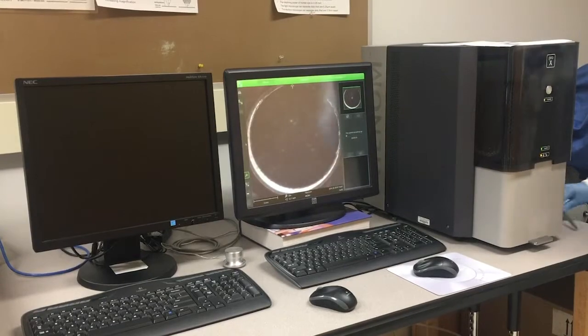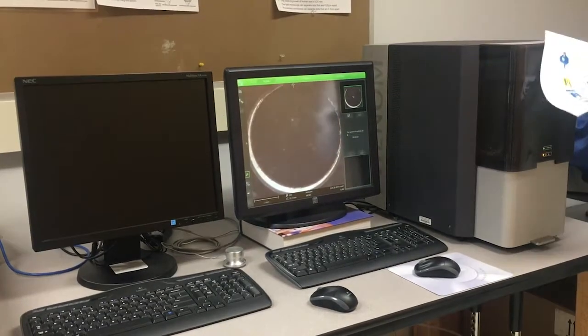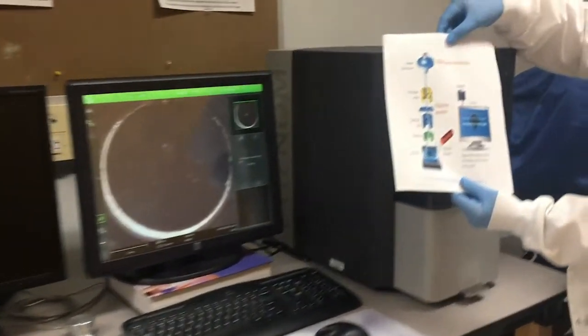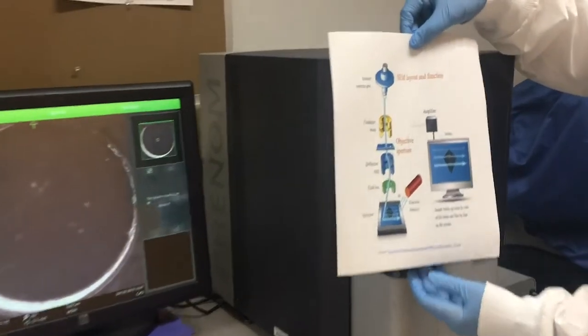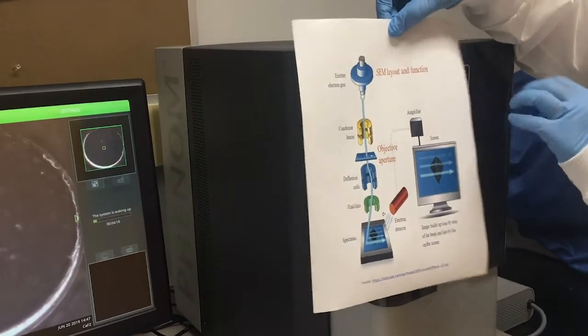It takes several seconds to generate the image, and here is a simple diagram to show what's happening inside the SEM.